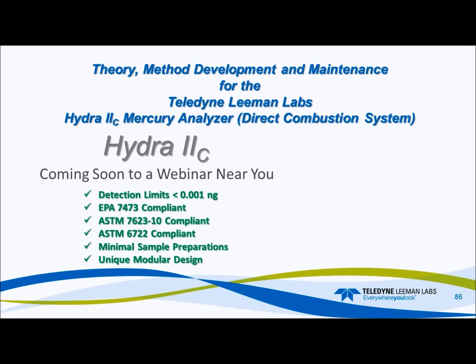So here's a little trailer. Theory, method development, maintenance for Teledyne Leeman Labs, Hydra IIC, mercury analyzer, direct combustion.